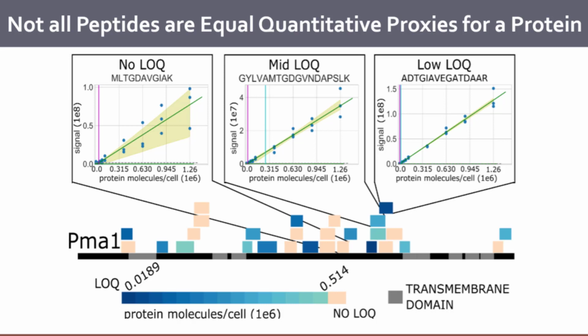That's harder to predict. So one of the things Brian did at one point is he actually looked across different peptides of the same protein, and there was about 2 to 3 logs of differences in intensity for each individual protein. Some of it's just they're not released from digestion. Some of it's because they don't ionize as well. Some of them are just because they're imprecise. So some peptides, if you sit them in the autosampler tube for too long, will just disappear. That makes them imprecise. And if they're imprecise, then we say that they're not very quantitative.